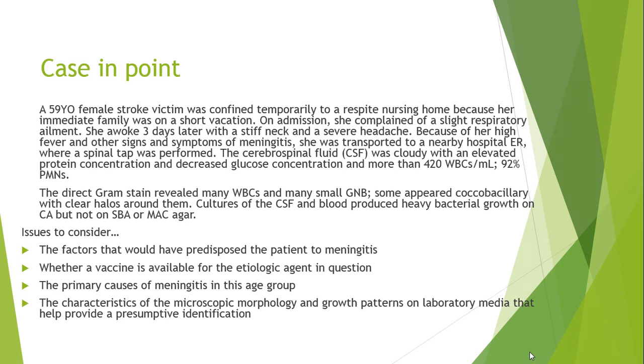Can I not be worried now? Yeah, because it's not Neisseria meningitis. It's something else that's not as serious as meningitis. So that would calm my nerves. Some appeared like a coccobacillary with clear halos. What does that mean?